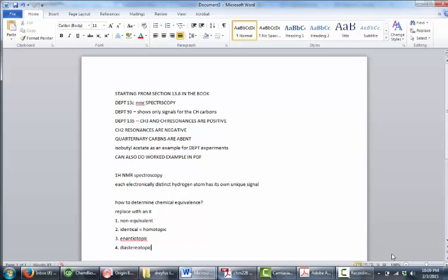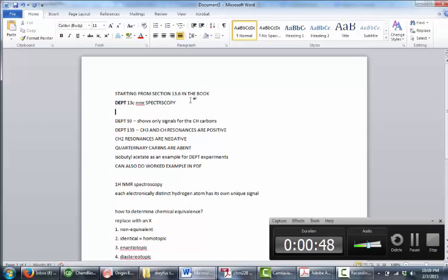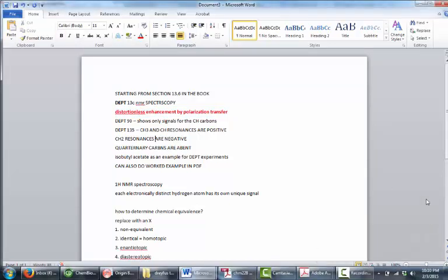And now we're going to talk in more detail about specialty information that we can get from doing this carbon-13 NMR spectroscopy. In particular, we're going to start by discussing what's called DEPT, D-E-P-T, C13 NMR spectroscopy, and that stands for distortionless enhancement by polarization transfer. It's a pretty specialized technique really, but practically it helps us in figuring out what our molecule is.